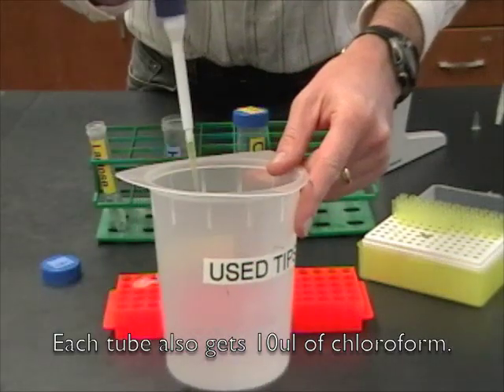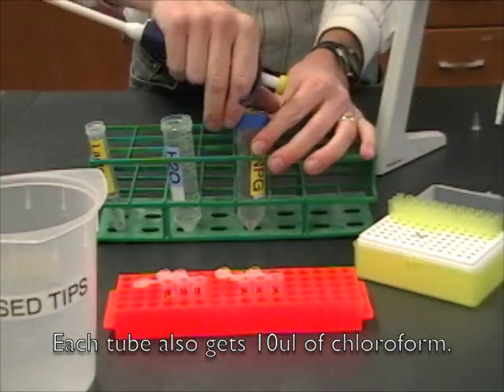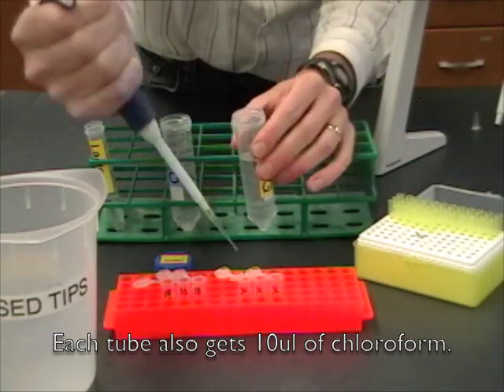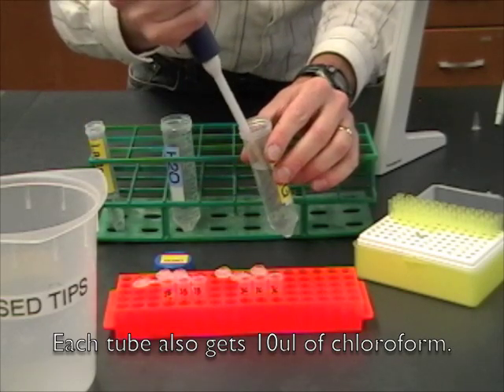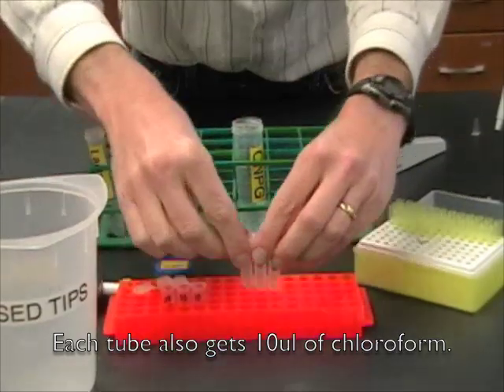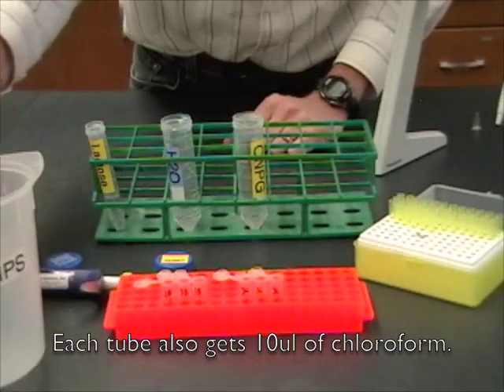I'm going to switch the tip when I'm done. Now my tubes of ONPG — again, 200 microliters in each one of these tubes. Take your time. And when you're done, it's good to give them a quick inspection just to make sure they all have the same volume in them and that you haven't missed a tube.